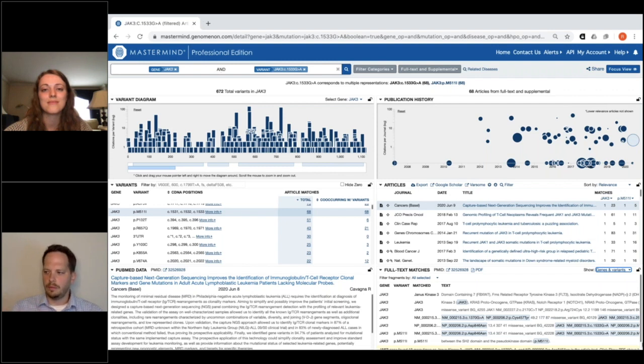And so I'm pretty sure, since Steve and his team were behind this initiative, the targets in this case, that Steve will have more to say, particularly when it comes to non-coding variants, which can be more of a challenge. So in Rachel's examples, we stuck to coding changes, but Mastermind contains non-coding data as well, non-coding variants.